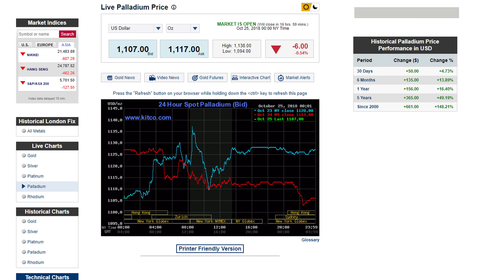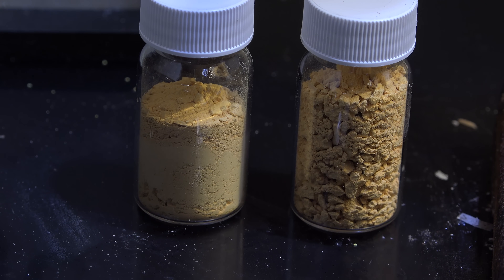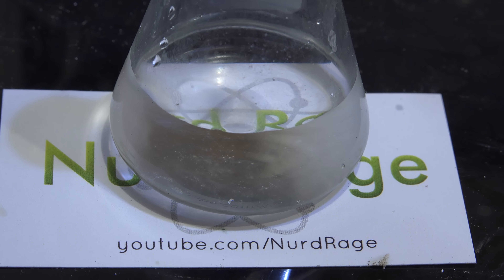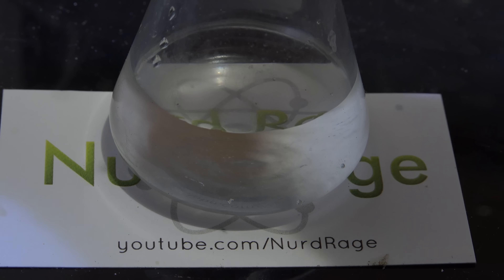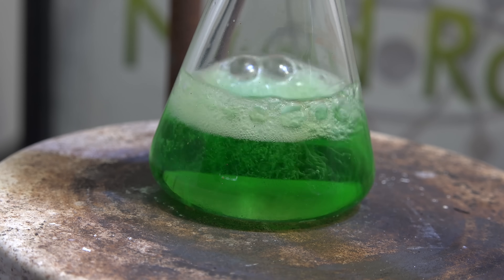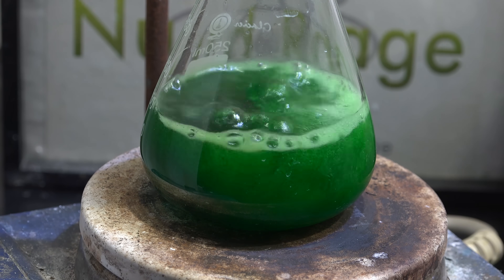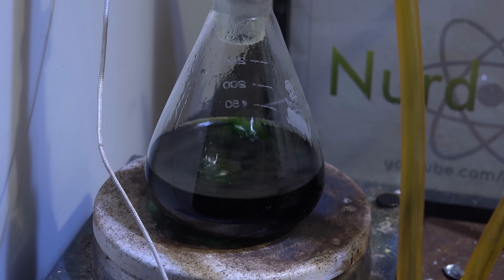To make my hydrogenations more amateur-friendly, I decided to try making a catalyst called Arushabara nickel. It's not as effective as palladium but the required chemicals aren't too hard to get. First I had to make nickel chloride. Nickel chloride can be purchased online, but nickel metal itself is often easier to get — you can even hack it out of nickel metal hydride batteries. So to convert nickel metal to nickel chloride I added it to hydrochloric acid. Nickel reacts very slowly at room temperature, so to speed it up it needs to be boiled. Eventually this forms nickel chloride. I made a lot of it since I want to do other experiments with nickel. I then boiled it dry and obtained nickel chloride.